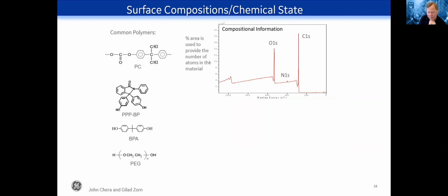An important application traditionally for XPS was the analysis of soft organic materials, especially polymers. And the nice thing about XPS, as you can see, the spectra are very simple and provide clear, intuitive results for many materials when the analysis is set up correctly.